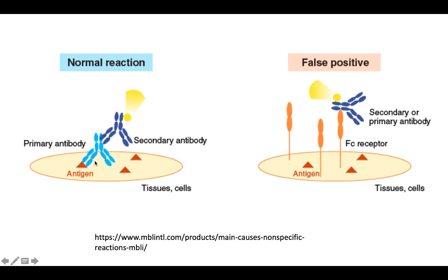The idea of the flow cytometer is you would first use a primary antibody, and then you would add another secondary antibody which would have a conjugated fluorophore which emits a certain amount of light. And nowadays you can even buy primary antibodies with the fluorophore already conjugated, which could just bind there directly and save the cost of buying a secondary antibody and also increase specificity, but they are more expensive. Okay, and so in a typical experiment, you would have positive controls, negative controls, and everything.